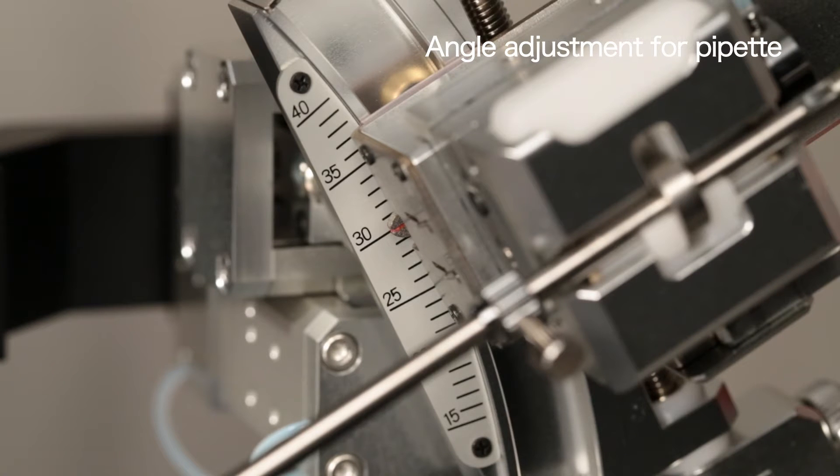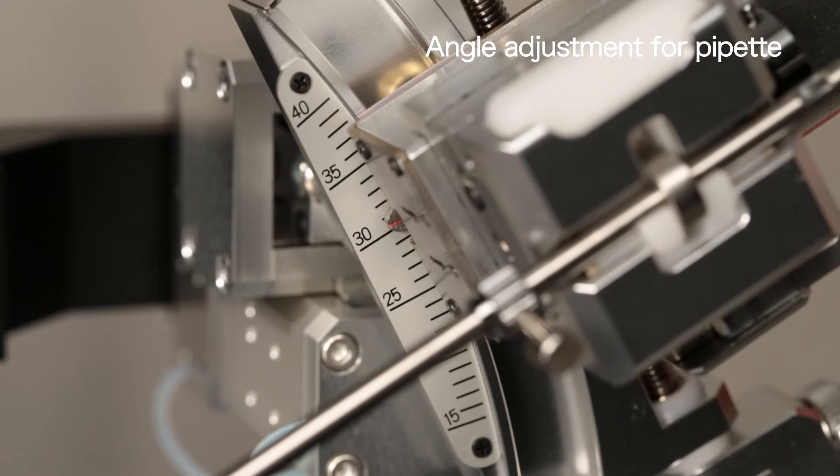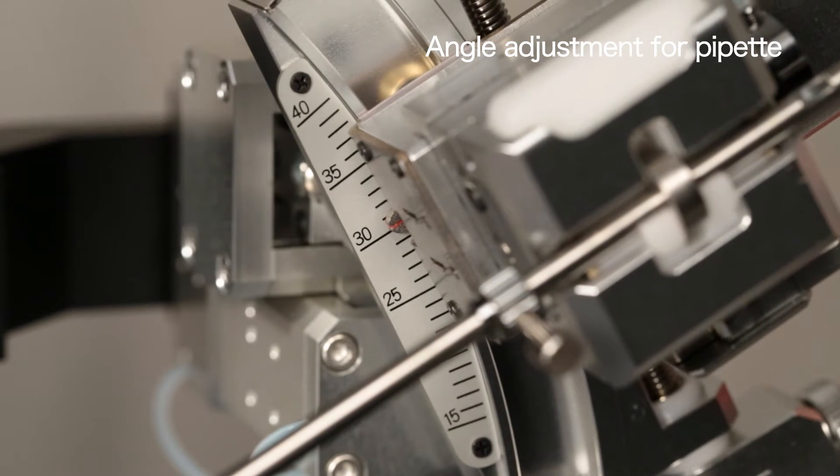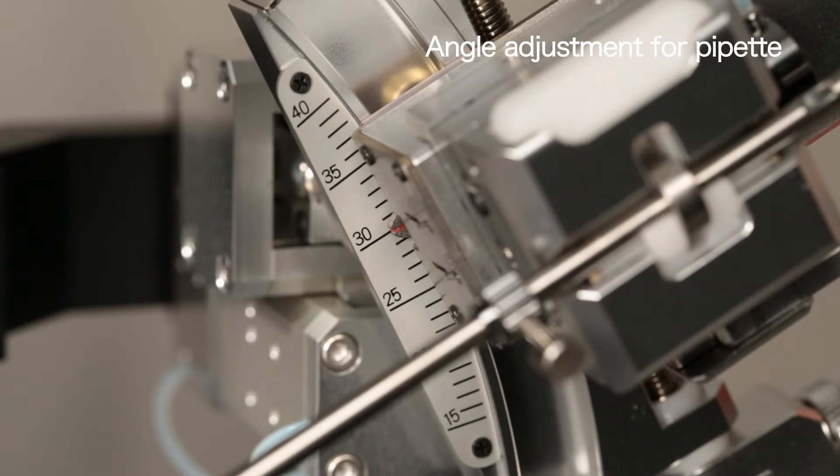Commercially available micropipettes often suffer from imprecise bending angle. The included angle gauge enables you to adjust for deviation to the exact angle degree.